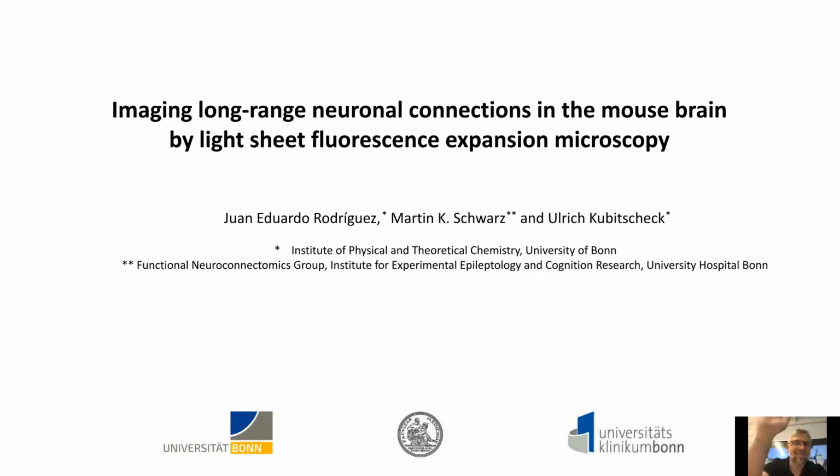So I will, in the first few slides, talk a bit about the motivation, the biological question behind why we are interested in imaging long-range neuronal connections. And then Ulrich Kubitscheck will continue with the basics of the technique, the basics about light sheet and light sheet expansion microscopy. And at the end, it will get really interesting. Juan will then show you results, and we'll talk about the achievements that we did so far using these techniques.